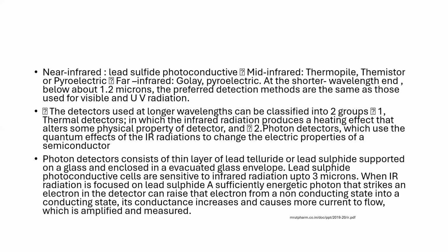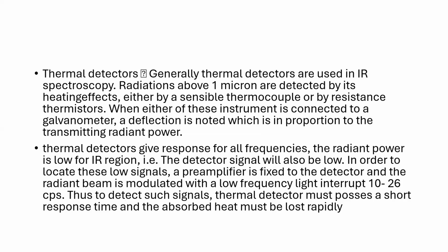The conductance of light is important. So the conducting material is required, and it should be working in the specific IR range. So for far IR, for mid IR, for near IR, you will have different collection systems or photoconducting materials that are used.